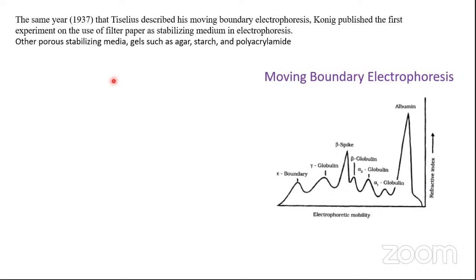The discussion about gel electrophoresis we will conduct much later, after we have understood the intricacies of paper electrophoresis. But the concept that should be remembered is that the stabilizing media should be essentially inert. We will talk about that aspect as well.